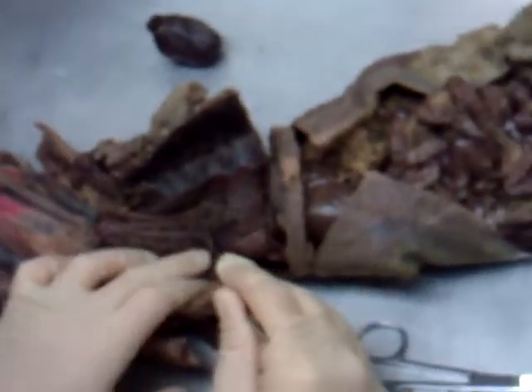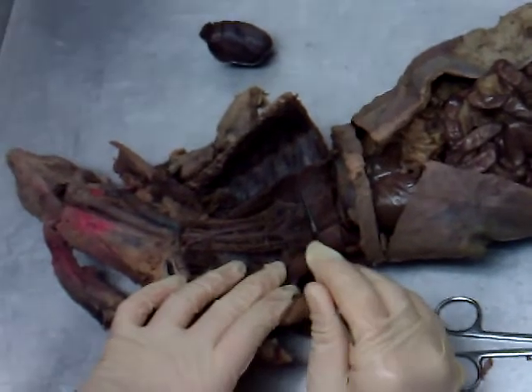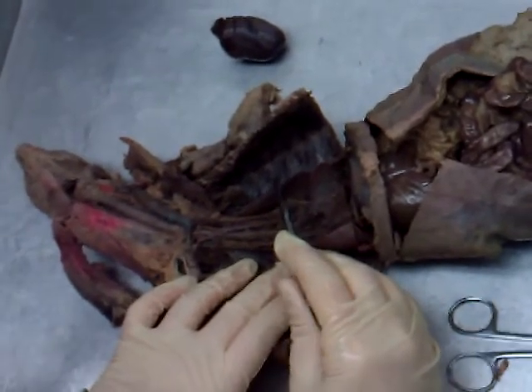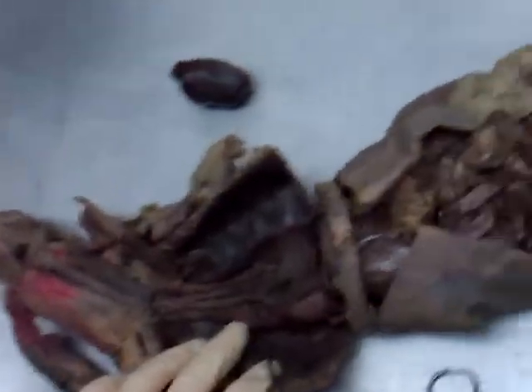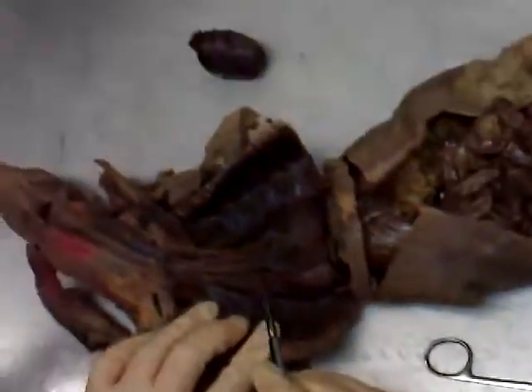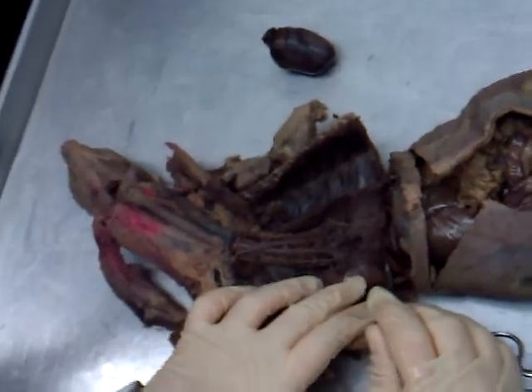Here is the trachea going all the way down. The trachea branched right here into the two bronchi — a left bronchus and a right bronchus. The mink's left lung has two lobes: a superior lobe and an inferior lobe. The right lung had four lobes: superior, middle, inferior, and the cardiac lobe.